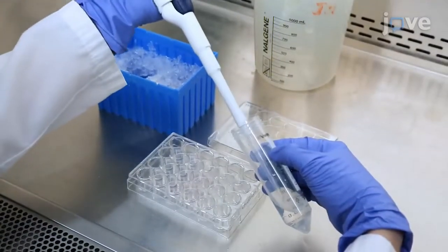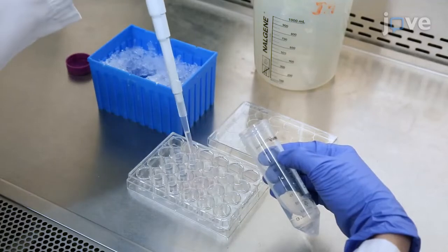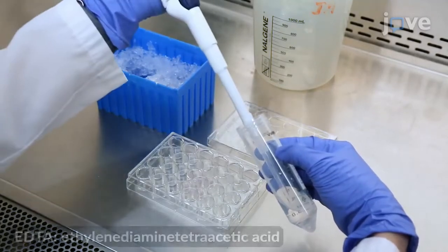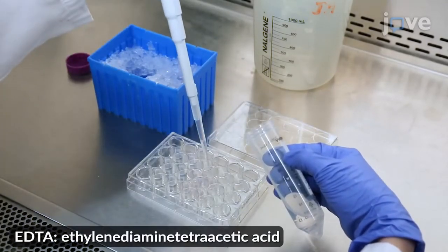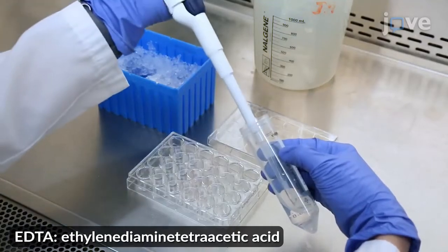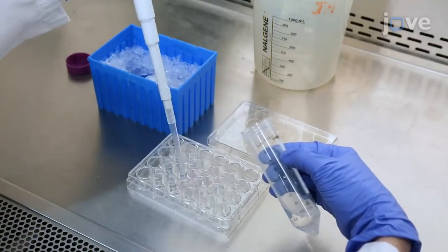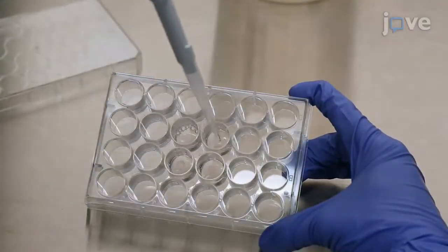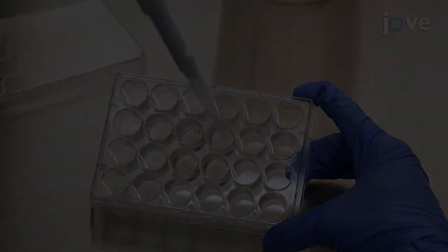To break up the ECM, add 500 microliters of ice-cold 0.5 millimolar EDTA to each well containing ileal enteroids suspended in ECM. Pipette up and down vigorously with a P1000 pipetter set at 500 microliters.